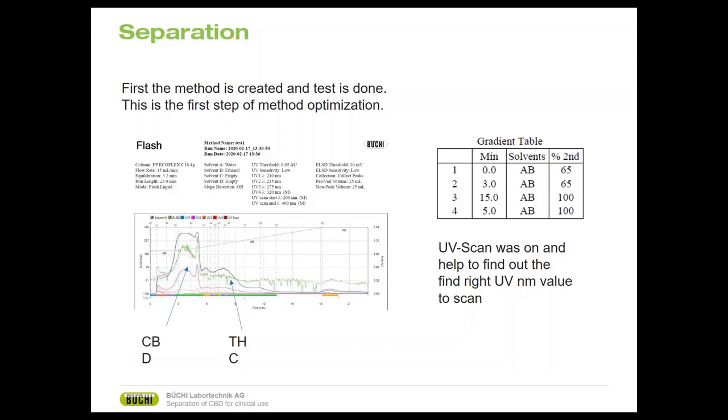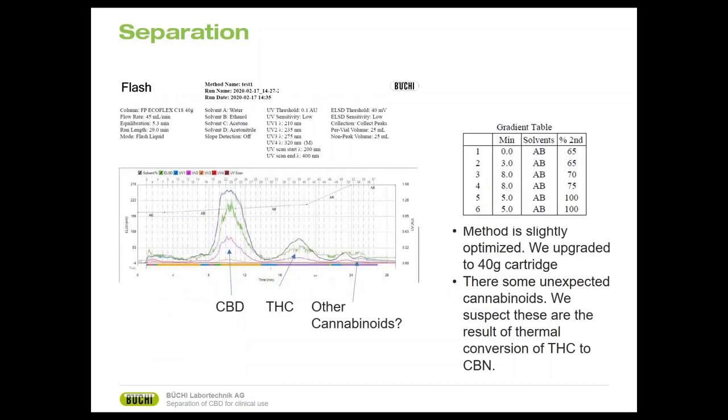We had the peak for the CBD and THC and a little bit of something at the end. However, the separation was not very good. That's why we need to optimize our method. We used the UV scan details for the exact UV signals of the cannabinoids. So on the left-hand side, there's a big peak. This is CBD. And on the right-hand side, you have a slightly smaller one, and it is THC. However, this separation is not very good. So we optimized our method a little bit and changed our cartridge. So this is the second one we had.